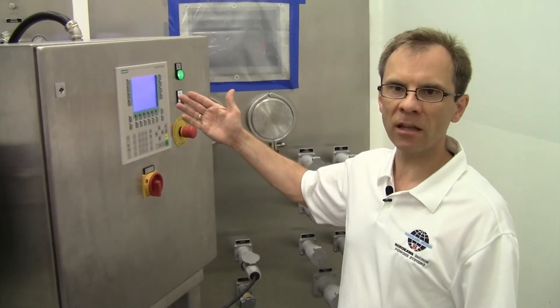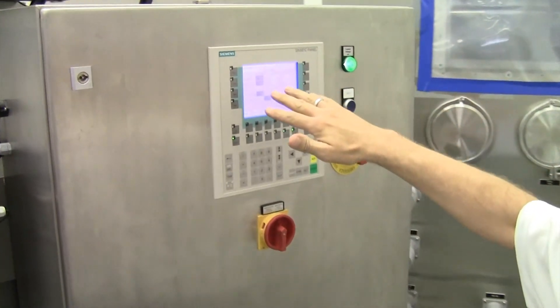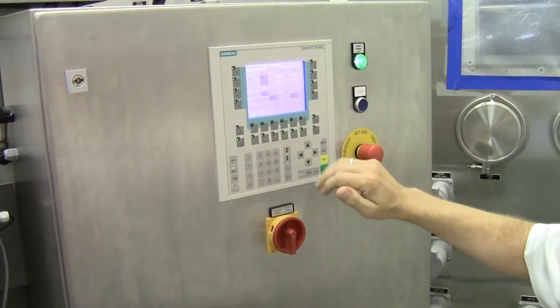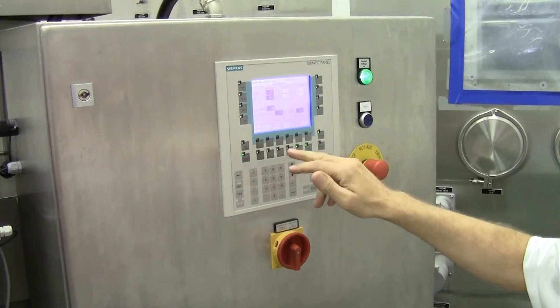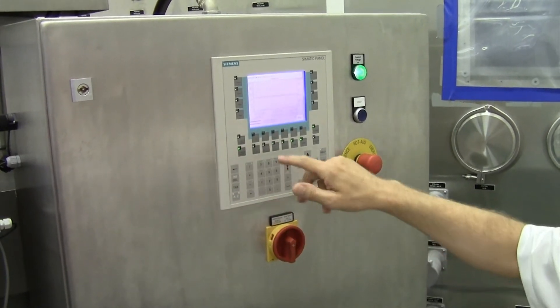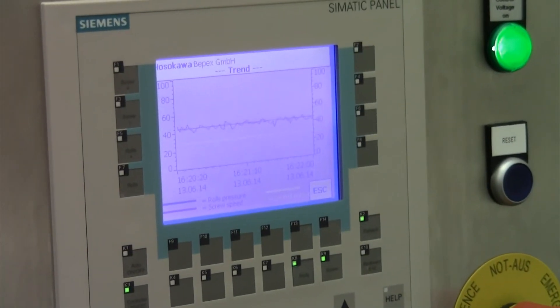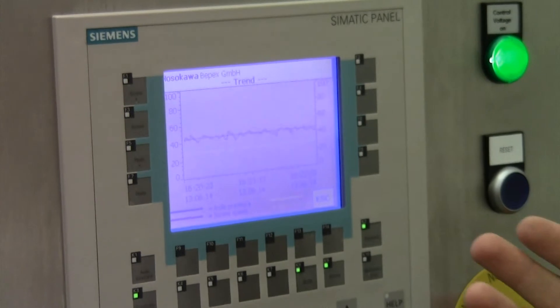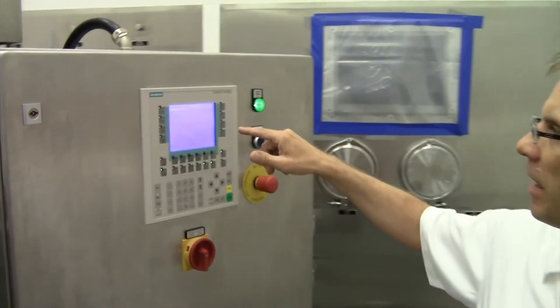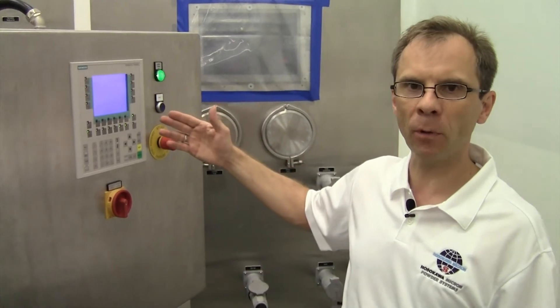Here we can see the actual control panel. It shows the different states and we can also see how the controller works. Looking at the trend, we can see the quality and homogeneity of the flakes we produce. You can see it fluctuates a little bit around the set point.